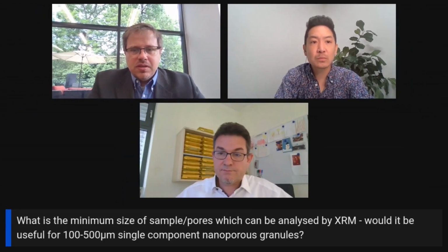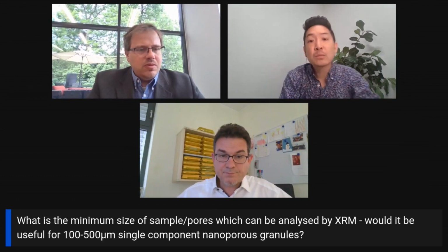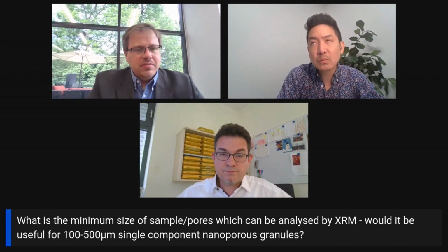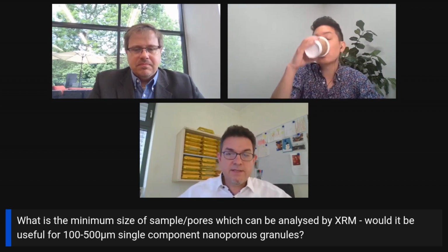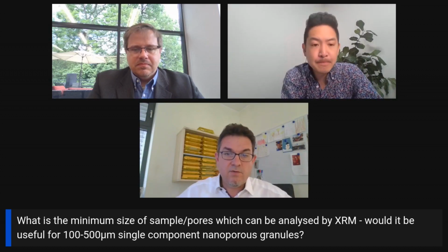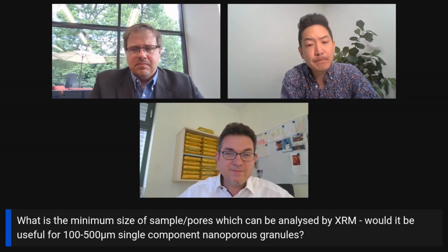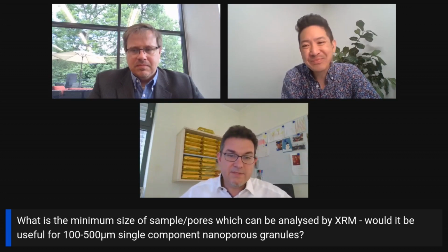And then the next question, what is the minimum size of samples, pores, which can be analyzed by XRM? Would it be useful for 100 to 500 micron single component nanoporous granules? So depending on the instrument that you have, the best possible spatial resolution is in the low 0.1, 0.2 micron range. So for nanoporous, you have to define how nano this is, but it can be tricky sometimes. If it's below 100 nanometer, for sure that is away from the X-ray diffraction limit.